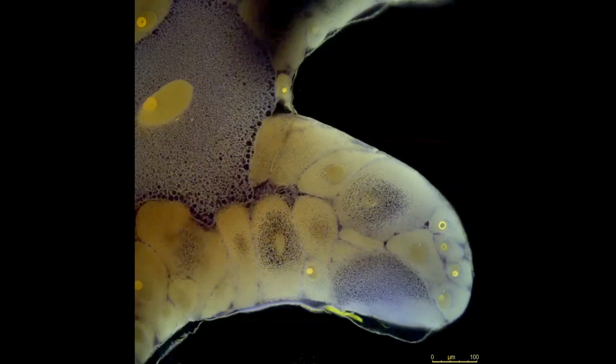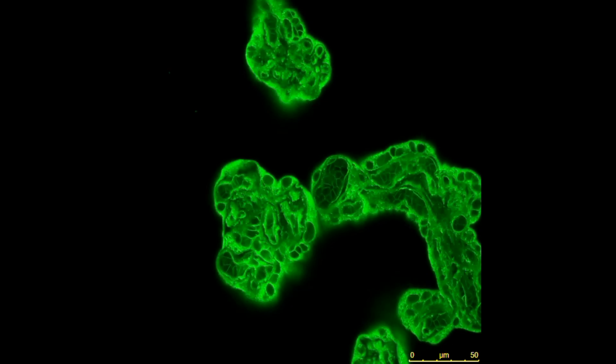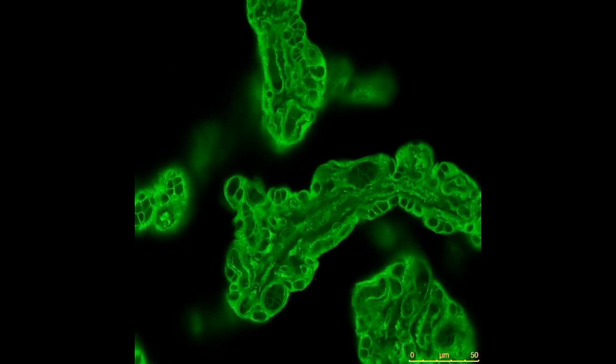Both allow us to create optical sections from within 3-dimensional structures by eliminating all of the out-of-focus information. Then, by refocusing the microscope, we can take a series of in-focus images at different levels in our sample, and then build these up into a 3-dimensional data set.